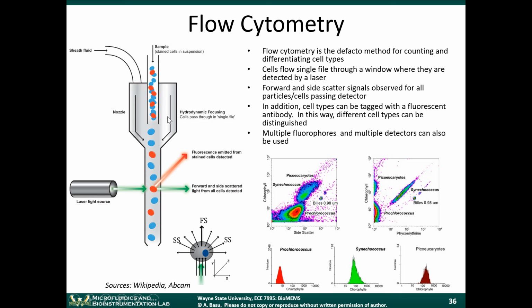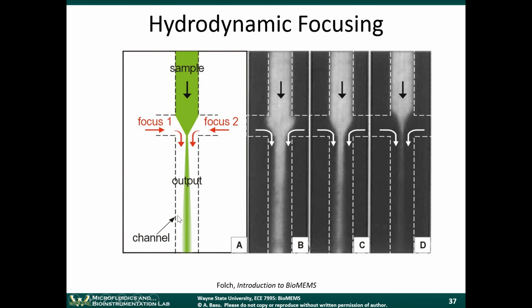This technique is referred to as hydrodynamic focusing because the 2 flows along the outside, or rather it's coaxial, it's going around the inner tube. The flows around it squeeze together. It focuses the flow on the inside. This is referred to as hydrodynamic focusing. So I'm just jumping ahead here. We'll come back to this slide.